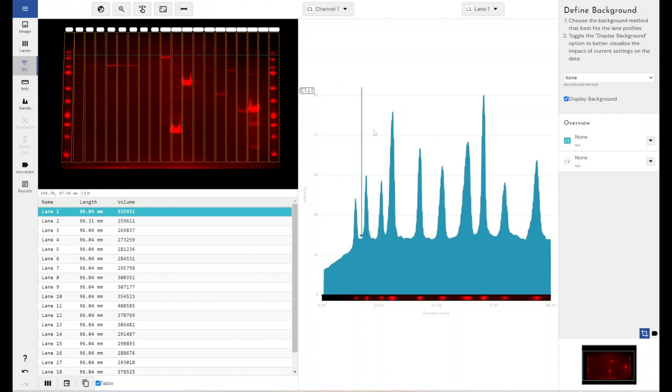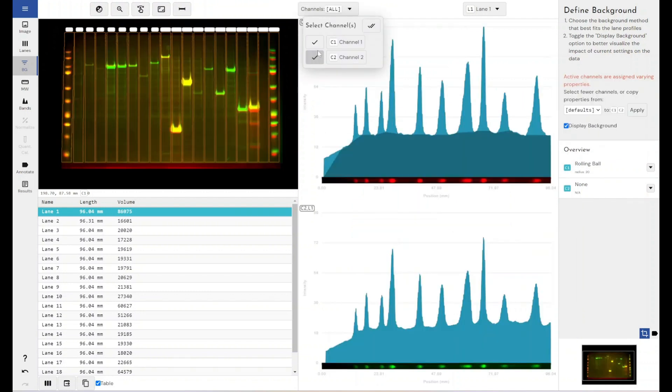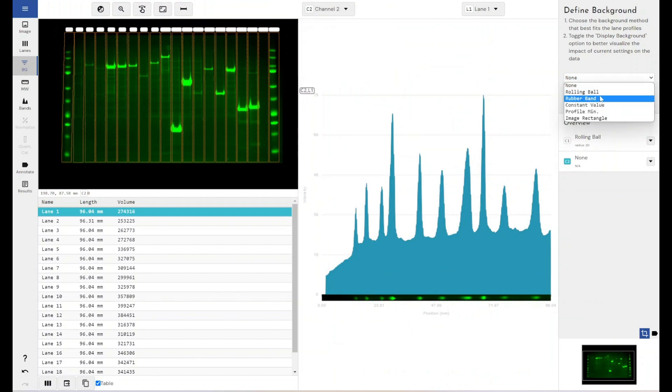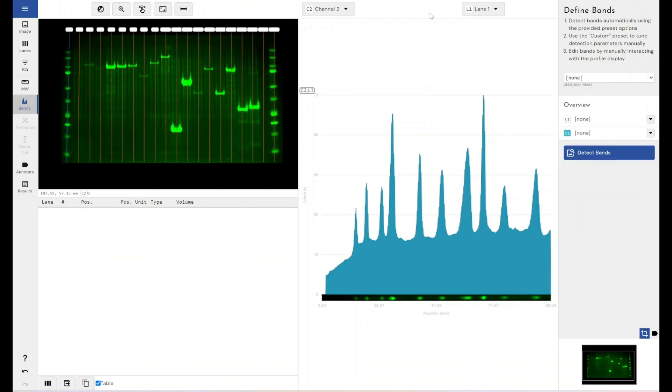For this, you would need to account for that by having different settings or even completely different background removal techniques in use per channel. So we've got that functionality within Phoretix 1D. What you would do is you would define your background removal technique for one and the parameters, come down to channel two and then again go in and select your parameters and your background removal technique specific for that channel.